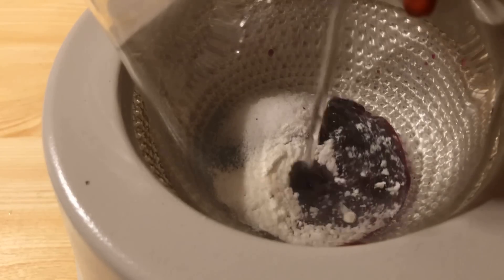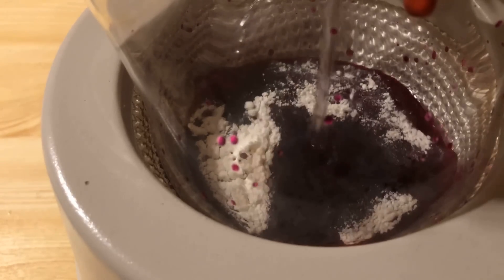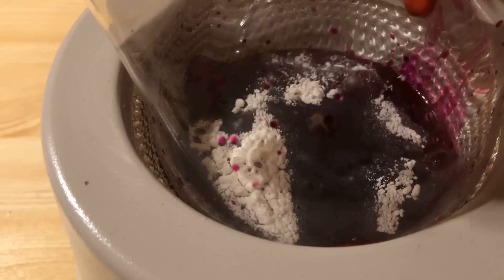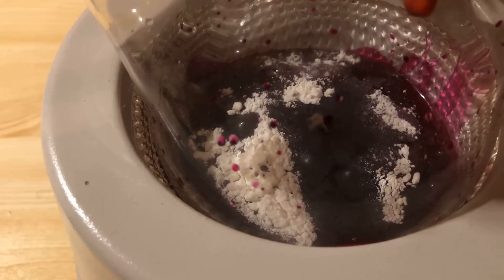Eventually, 100 ml of distilled water is added. Immediately, the pink-purple coloration typical of phenolphthalein at a pH of 8.2–12.0 appears.